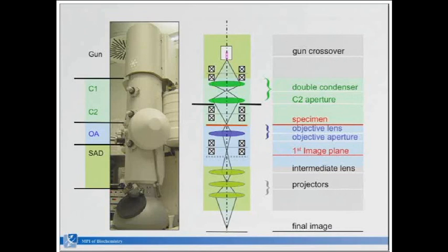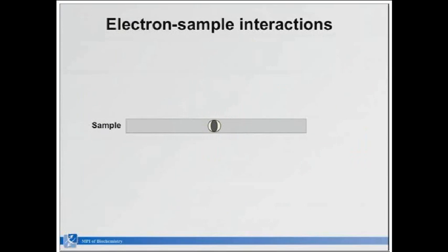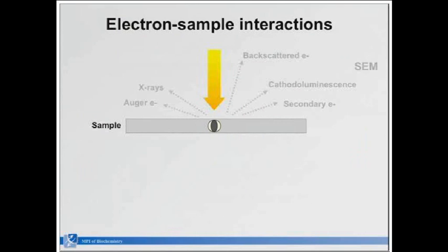So this is just only depicting where the specimen sits, where the coils are. One are above the specimen, one below, which are very essential for low-dose exposure schemes. And you have the condenser setup where you just only increase the illumination when you would like to look at your sample. When you interact with your sample, I told you that you create maybe some damage, but how is this damage generated? So first of all, you have the electron beam hitting the sample.